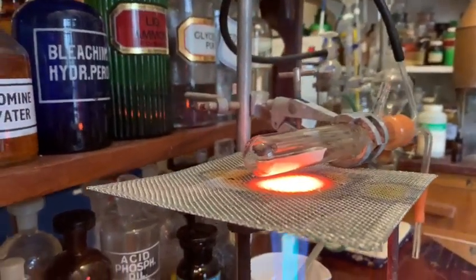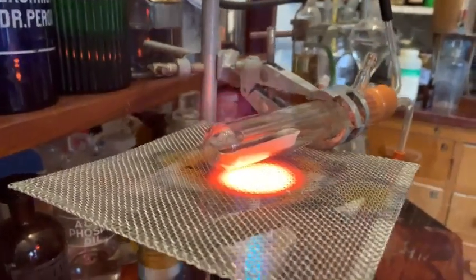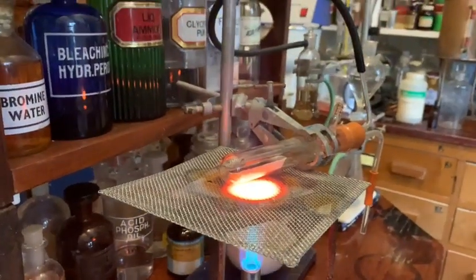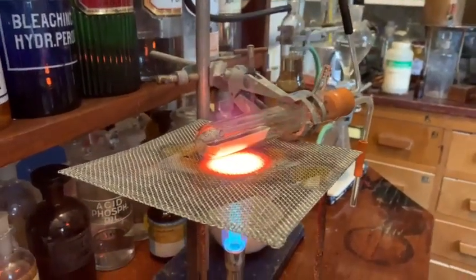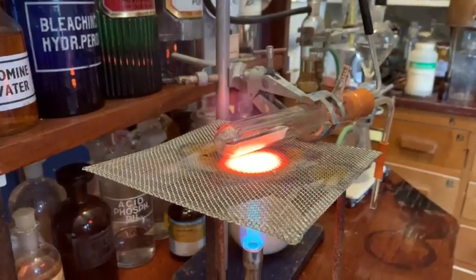We're going to use this finely divided copper in another experiment — an organic experiment — by mixing it with zinc to make a zinc couple that we're going to add to ethyl iodide to produce some zinc ethyl.